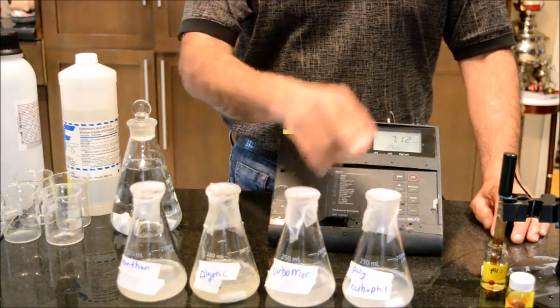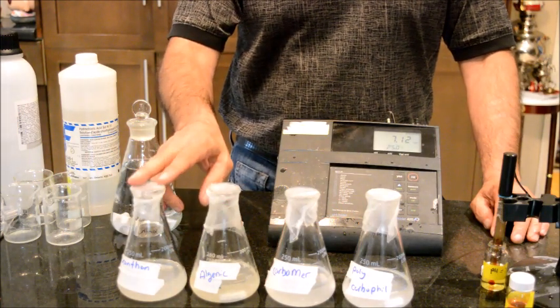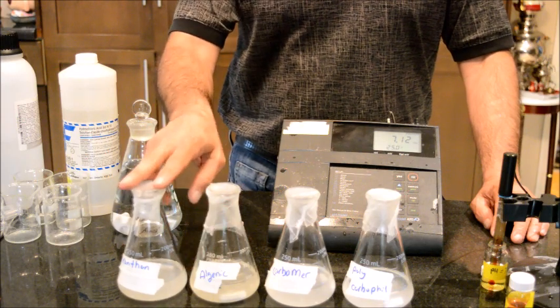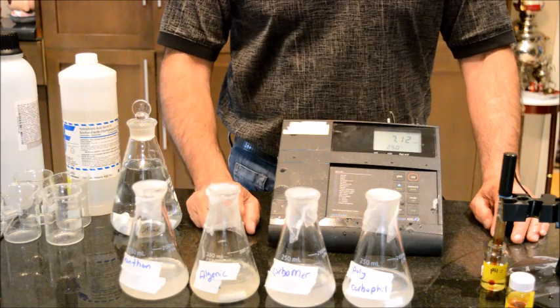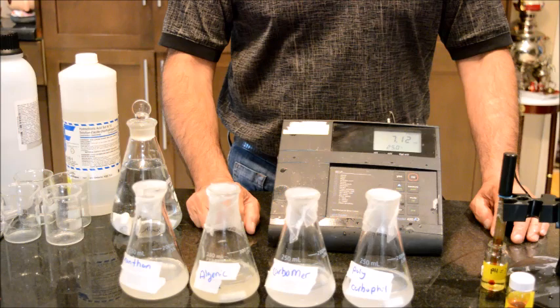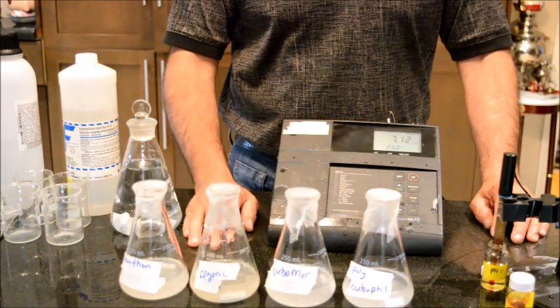Now all these 4 gelling agents are prepared in water at 2% weight per weight. Now why 2% weight per weight? Because I looked at the IID database and I saw that the gelling agent for the vaginal suppositories usually comes around 2%. So this is why I picked the 2%.